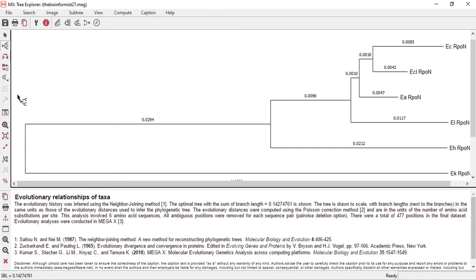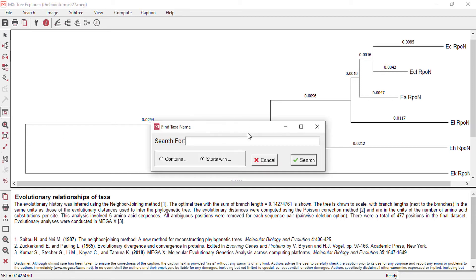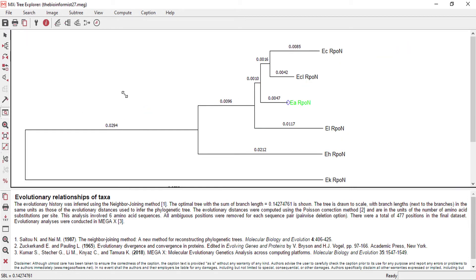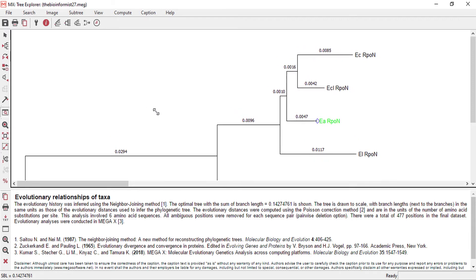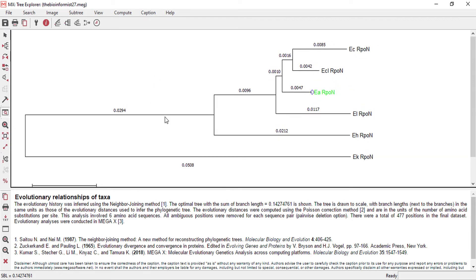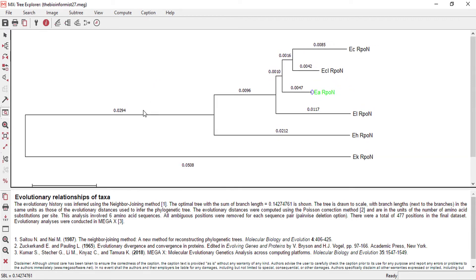We can zoom in and out. We can search for a particular taxon. We can simply give a taxon such as EARP1, so it highlighted EARP1. Here we can resize the tree and focus on the branch that we require. This was the basic introduction to MegaX tree construction.